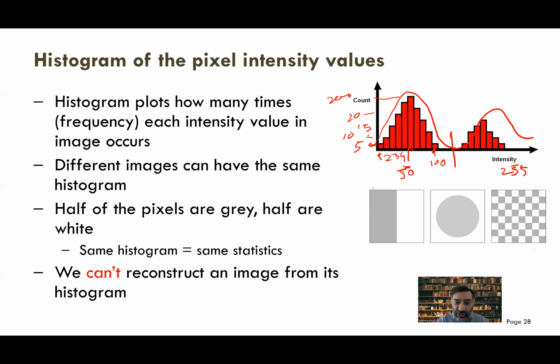We want to extract this gray area. If we do the plot of this histogram, we can see that that's where it breaks. It could be 110. And then we can say anything above 110 is 1, anything below 110 is 0. So it's going to make a binary image exactly extracting this region of interest.